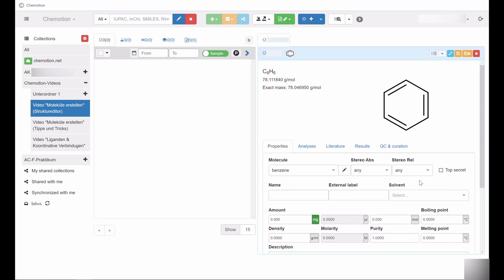Moreover, you can generate an additional name as well as an external label for the entry. Assign external labels if, for example, the structure created in Chemotion will be registered in other databases as well.